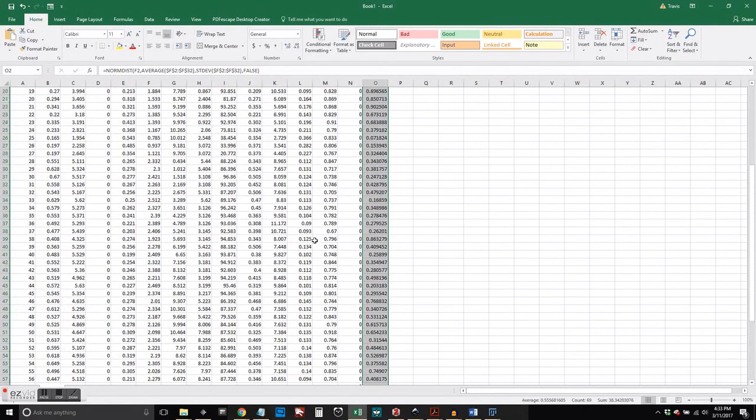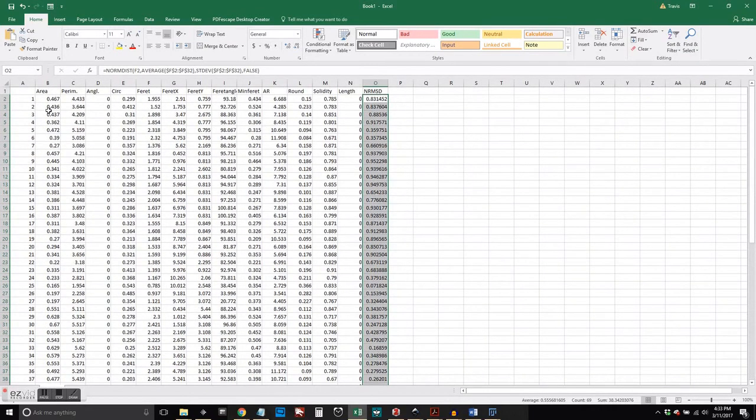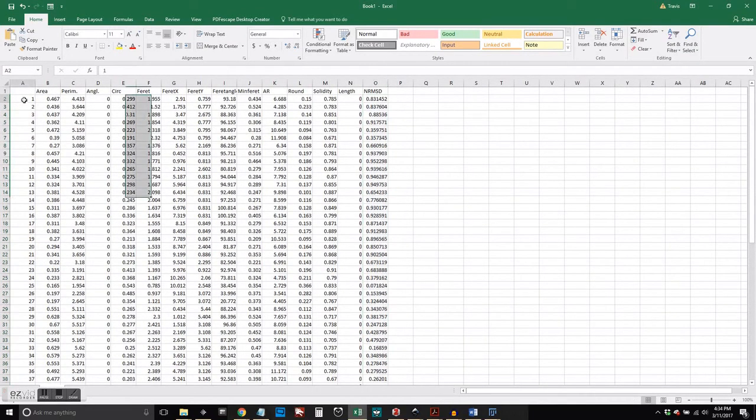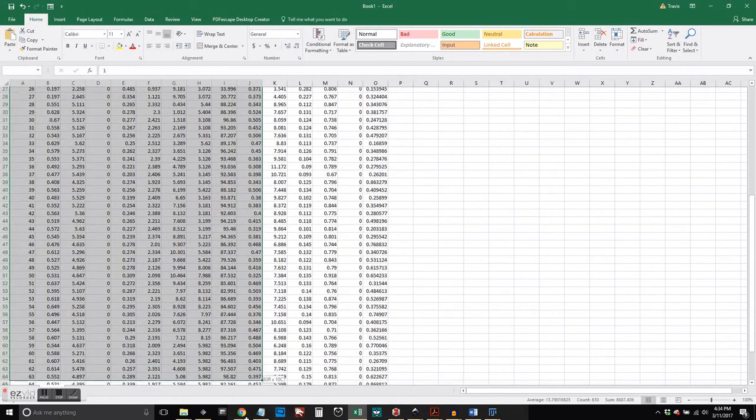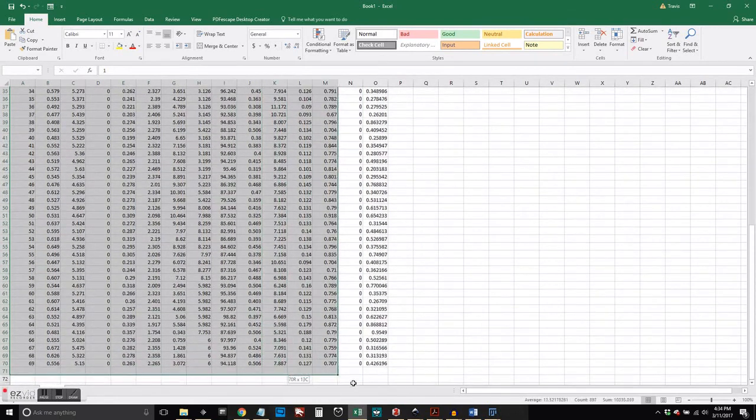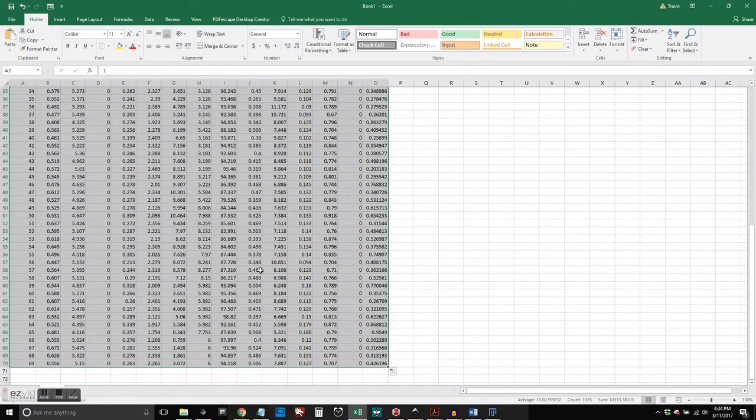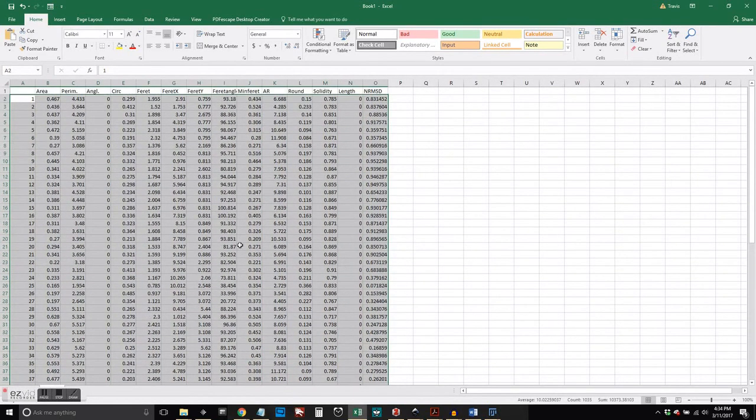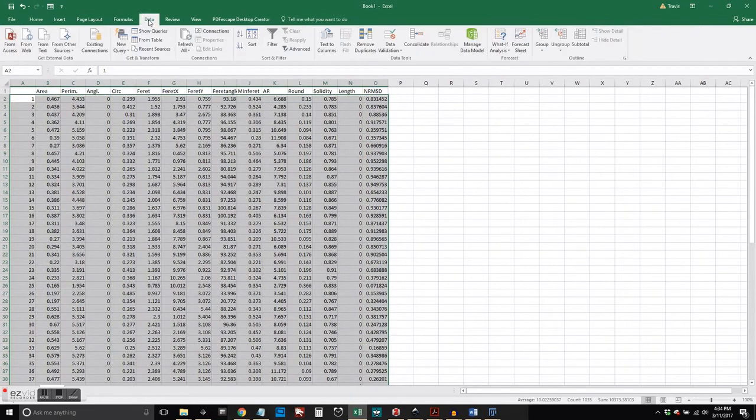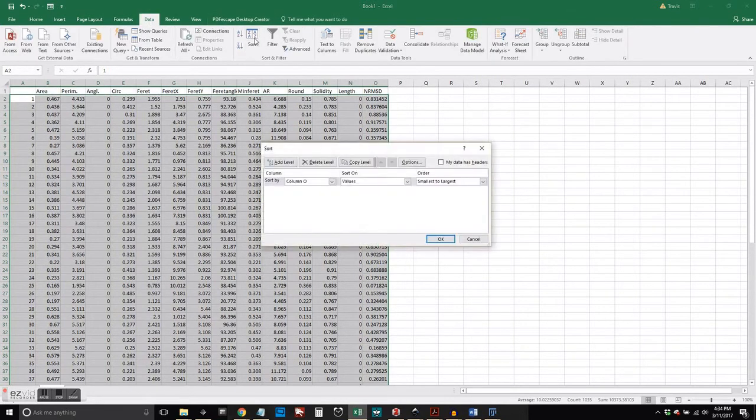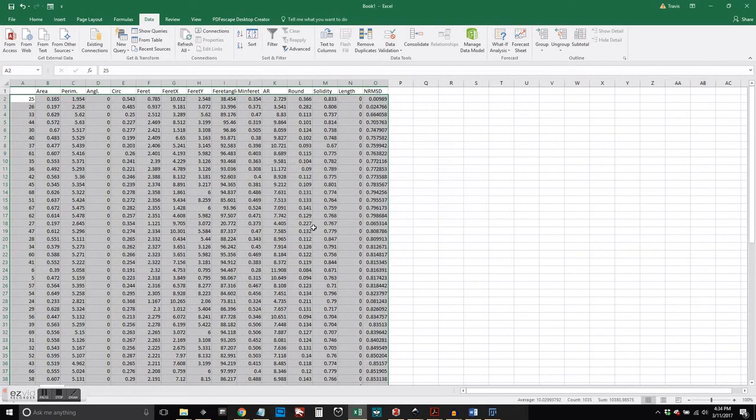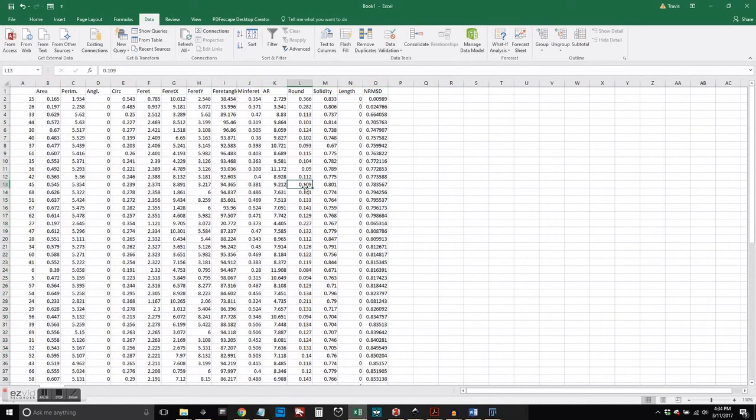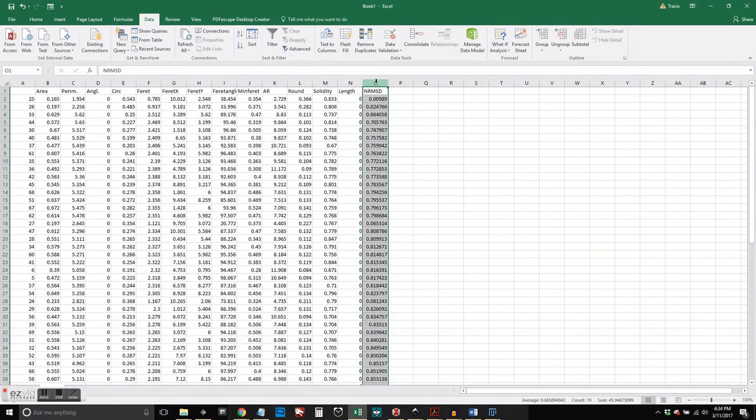And you can see under the NRMSTD column, the O column there, the equation that I'm using to have Excel get my normal distribution and my standard deviation. And then I'm just applying that down the column.